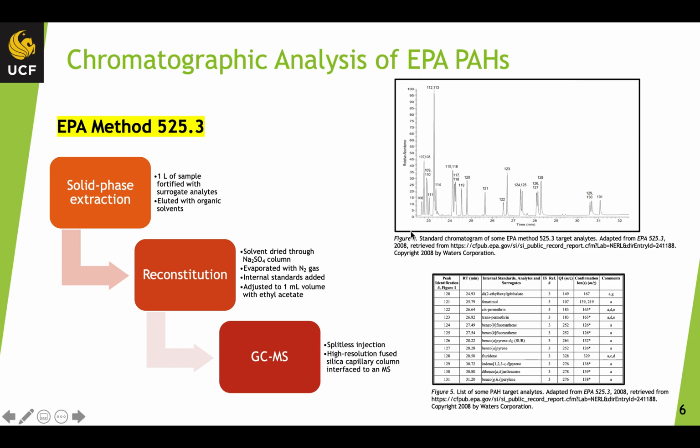And here's another sample chromatogram including these analytes listed here, and as you can see, the separation is successful. Not quite as clear as the previous, but still satisfactory in order to be able to identify these 16 PAHs.